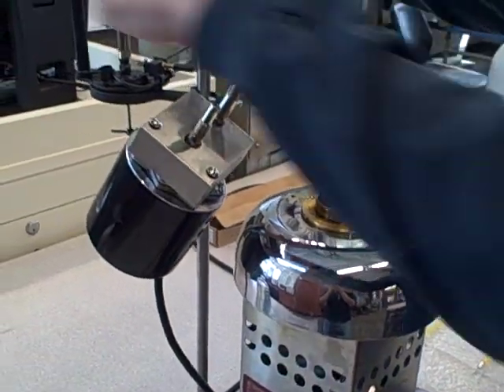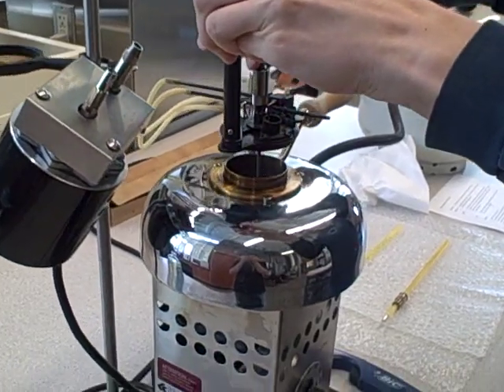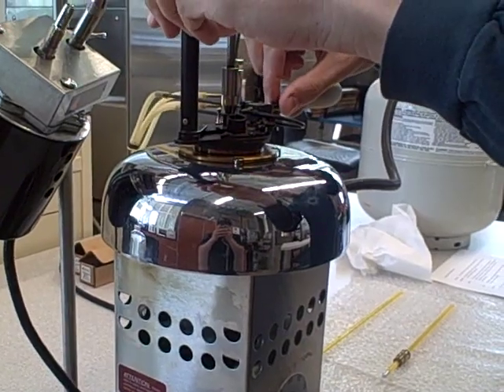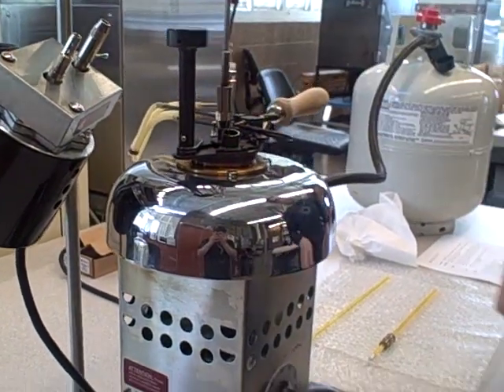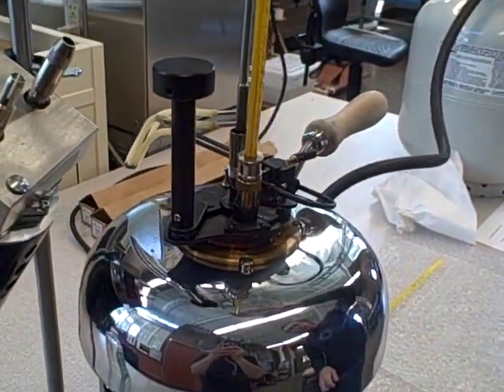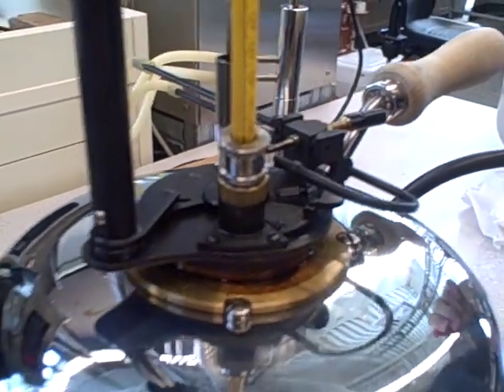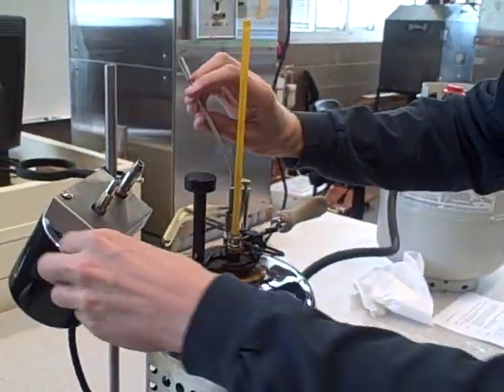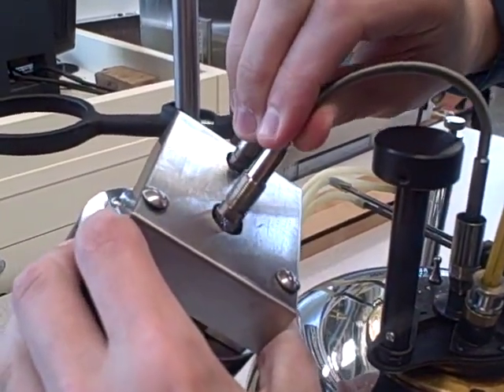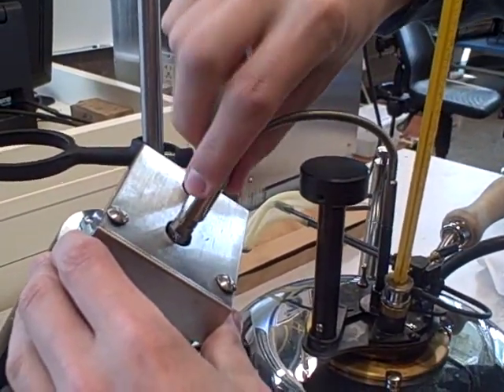And then you place the lid on top and kind of wiggle it in there so you get a firm seal. And then place the thermometer into the hole to finish the seal. Make sure you put the stirring device back into the motor — stick it into that one there, and then slide the cover over and screw it on.